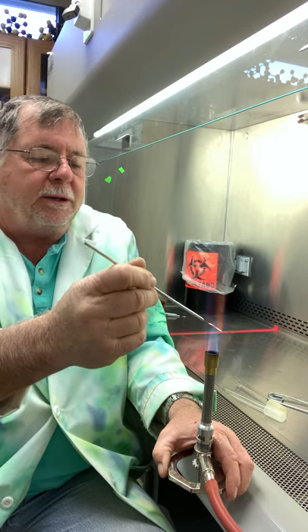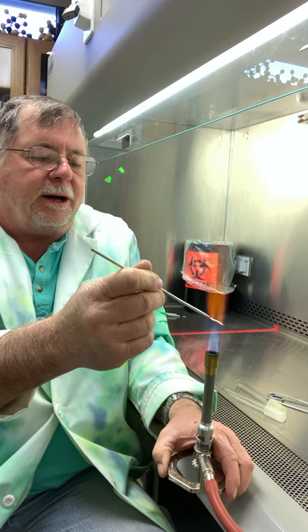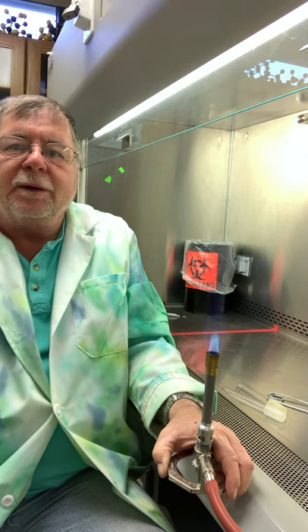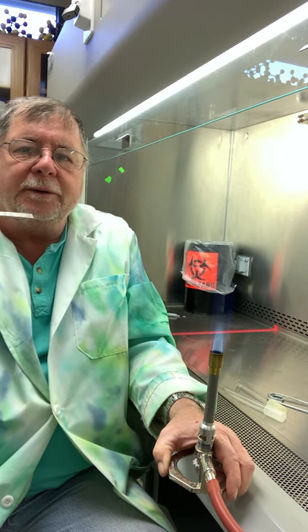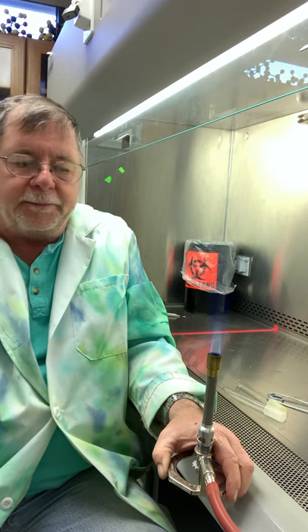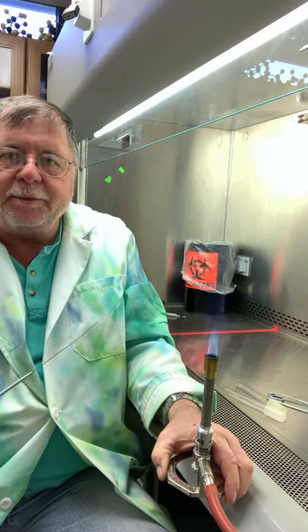And you don't want to go below because that actually is cooler. You don't want to get too high, but just go right above that and go in about a 45 degree angle. And once you've gotten it red hot from the loop to the end, to the handle, then you are sterile. As long as you don't put it down or touch anything, then it remains sterile.